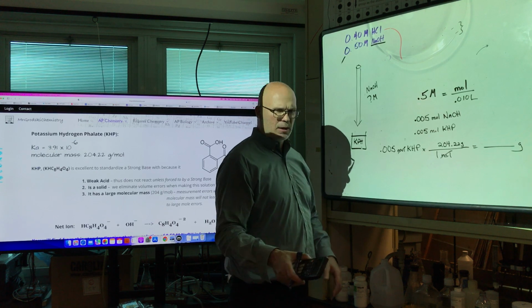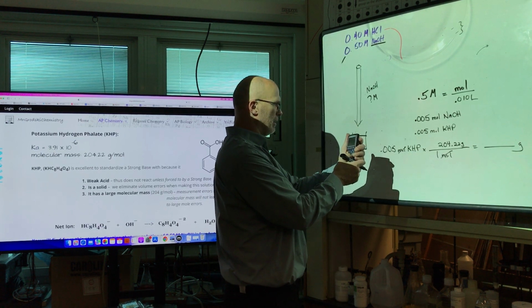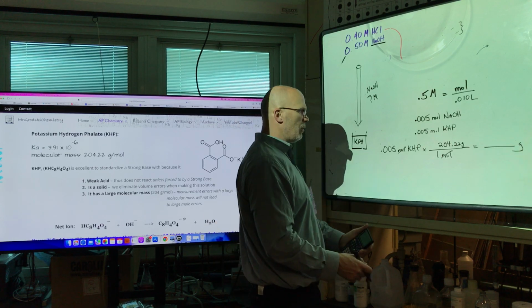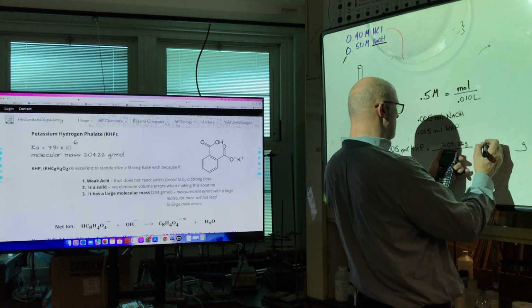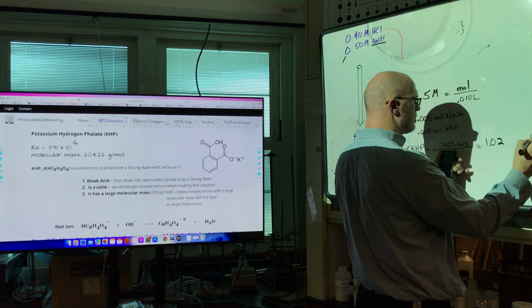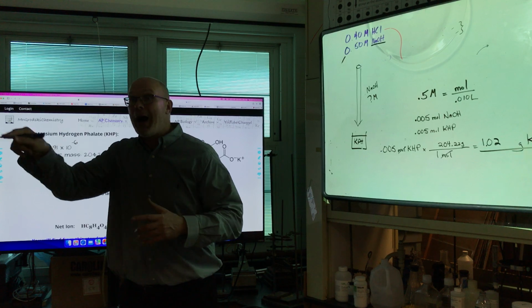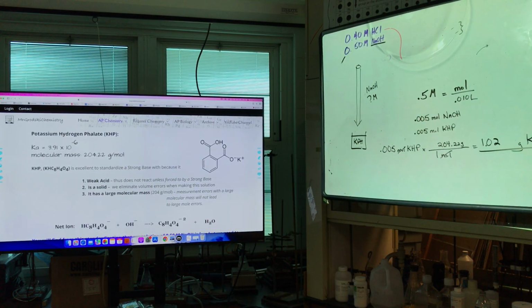Well, I can do this math, I guess. So 0.005 times 204.22. And what do we get? Yeah, so we need 1.02 grams of KHP. That's cool! All I do is find the grams. I have a little bottle. It's a solid. Measure out that grams.